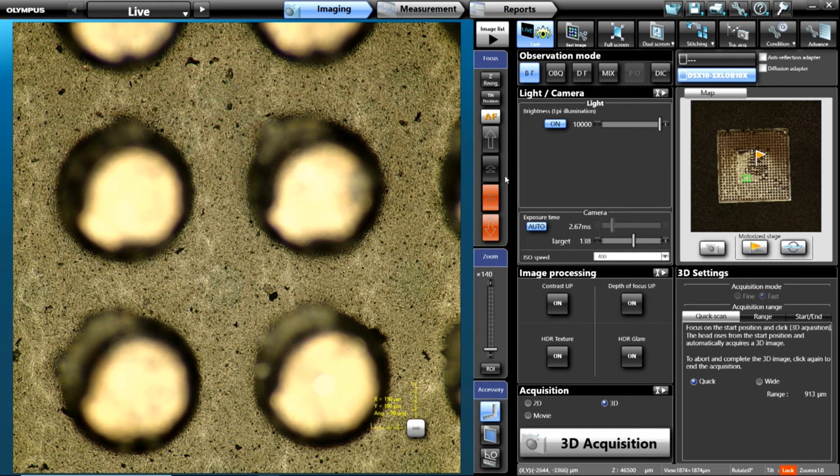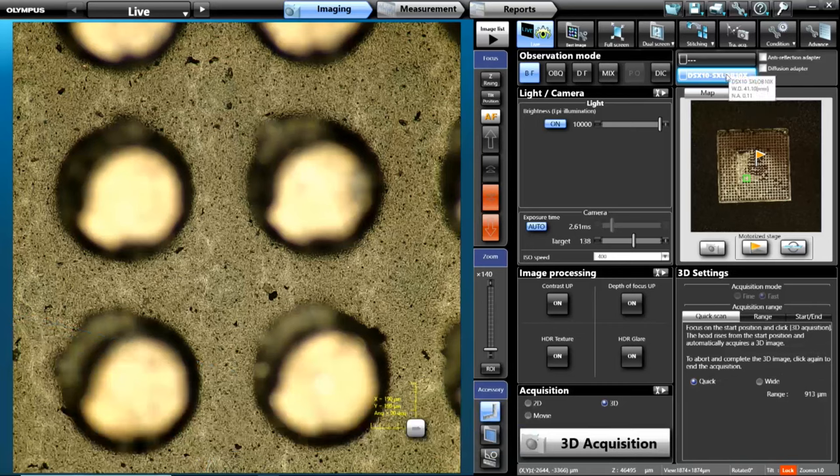Right back into focus on the same spot. I had those four pins centered in the field of view and you still see them. When I pushed it in, there's a click mechanism that holds the lens into the lock position, centered position. So a combination of very accurate mechanical indexing of the lens back into place along with the software allows you to completely remove one objective, put another objective in place, and go right back to exactly the same spot on your sample. You'll be within the same spot and within the same focus — you just hit the autofocus button on your hand switch and it'll autofocus. The software also automatically detected that we switched to the 10x objective, so all calibrations and shading corrections are automatically applied for the lens you've popped in.